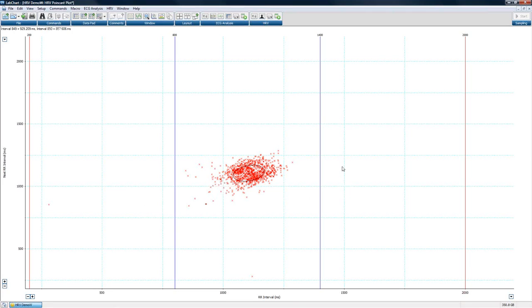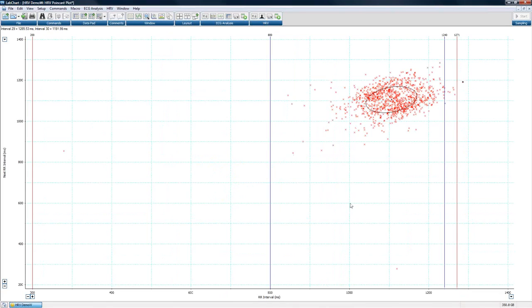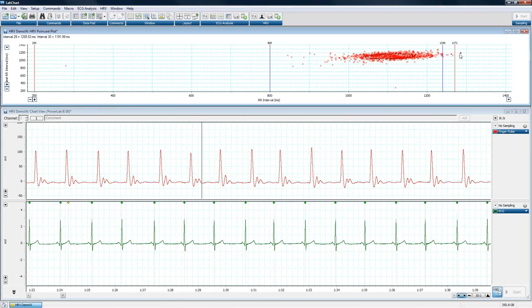You can change the normal, so you can see we have our lines here for ectopic, normal, ectopic, and artifact here. This will be a great way for it, and you can actually adjust these parameters on this among other plots. I'm going to go ahead and do a smart tile here.